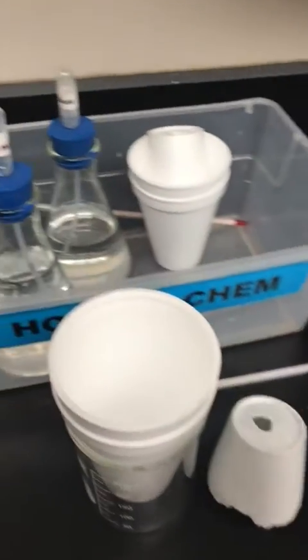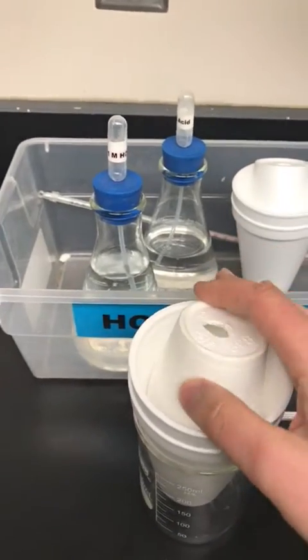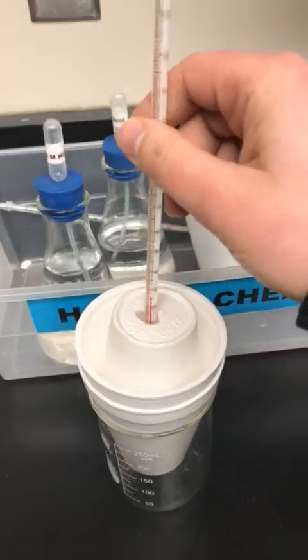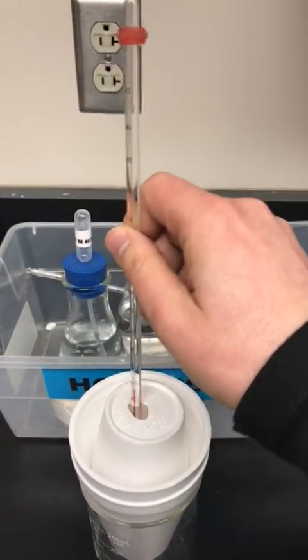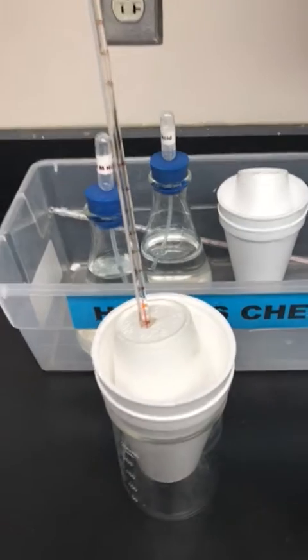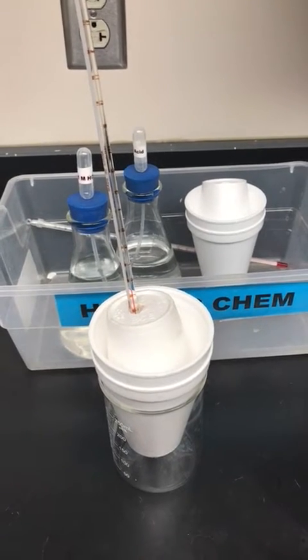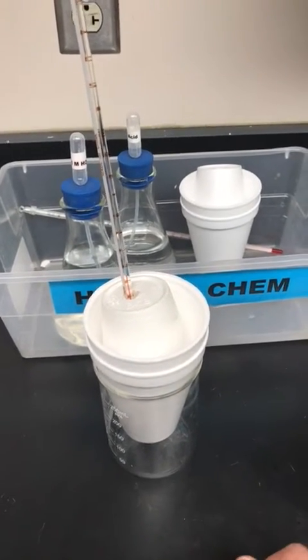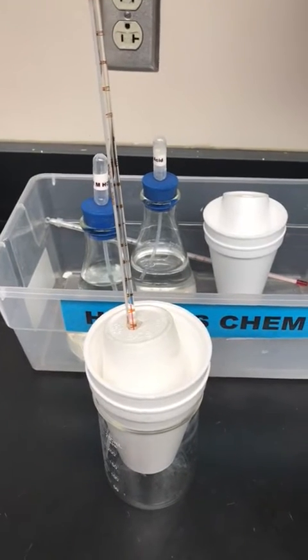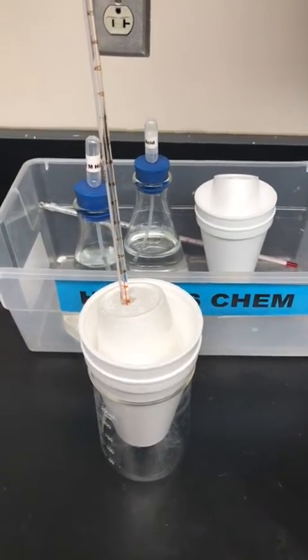And then you are going to take your solid and place it in here with your solution, and as soon as you place it in, you're going to immediately close this and then put the thermometer in here. You want to monitor the temperature, and you also want to stir as well. You will see that the temperature should change eventually. If it's exothermic, the temperature should go up and then become steady and then go back down to room temperature. In that case, the highest temperature is your final temperature. Or if it's endothermic, then the temperature will decrease, go down, and then stabilize and go back up to room temperature. In that case, the lowest temperature, the coldest one, is your final temperature.